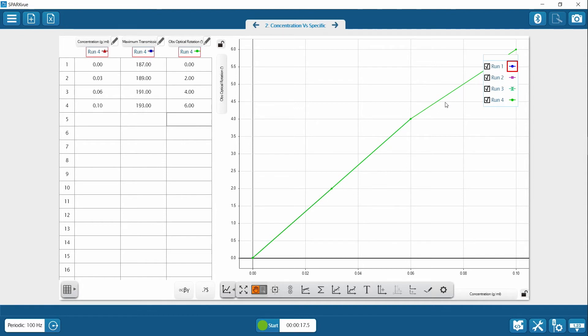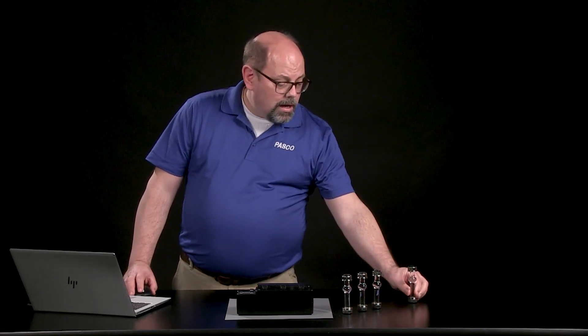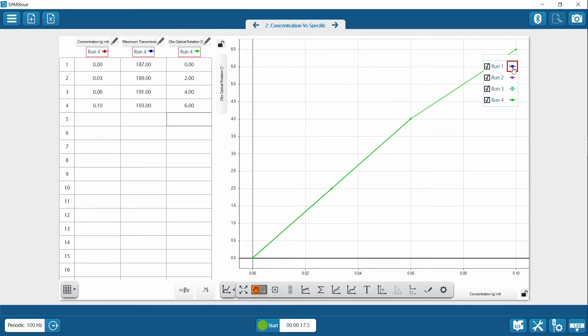Now, you may also say, hey, I want to know what the line is that fits through this because I want to guess at some unknown solution, which I've made here, and I want to find out what that concentration is. So what you're going to need to do is look at this legend here, and you've got to highlight the last run you made because that's the one that has all four of these data points in. So you're going to have to switch to run four, and then you can do the line fit through that, and it'll have this great line that'll say, here's the best fit through here.